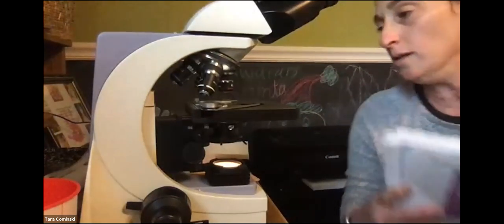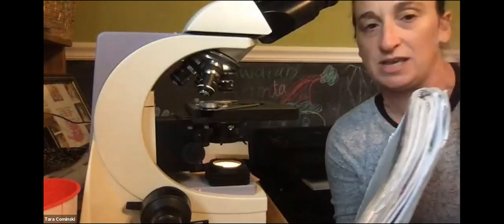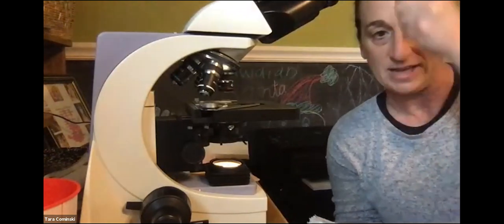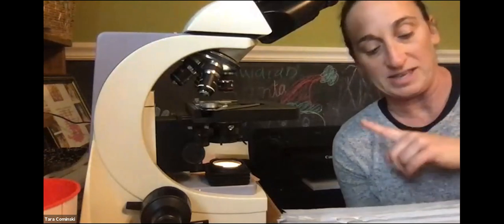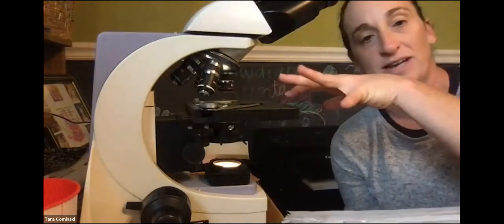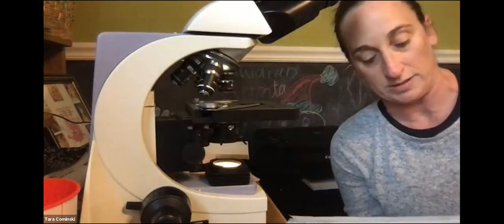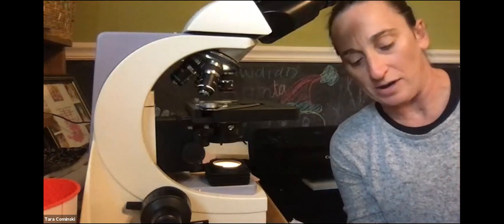All right, I'm not going to read through all these separate parts in terms of how to focus. I'm just going to give you a little bit of an overview of how to do that, okay? And then, like I said, I'll show a video to show you what I see in that microscope with this letter E. I'll use the letter E slide to show you the proper way of setting this up and getting it in focus. Okay, and then it talks about going under high power.